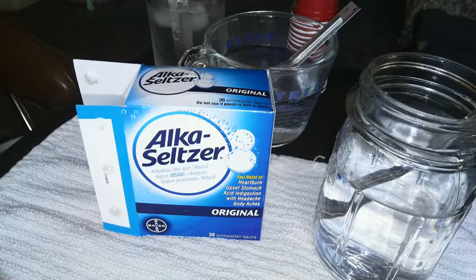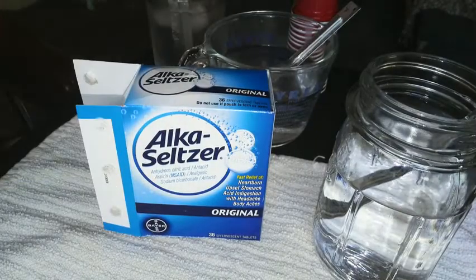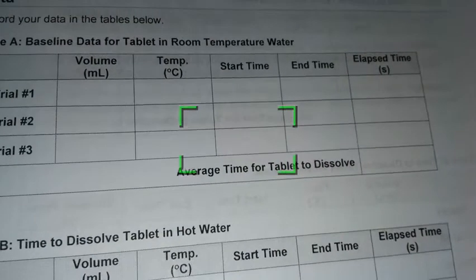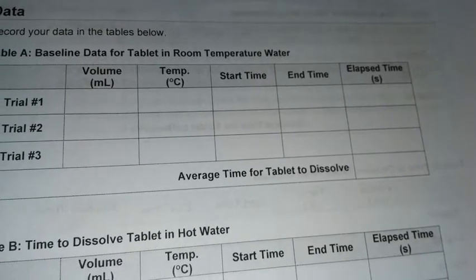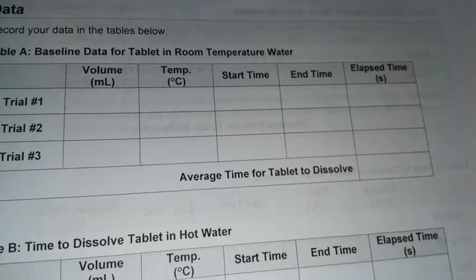Hey everybody, this is Miss Peachy from WCA Physical Science, and in this segment of the video, I'm going to be actually doing the data collection of the portfolio for you. Okay, so you're going to want to have your data tables. I printed out the data tables from that sheet on the website. If you don't have them printed out, that's okay. Just have it open on your computer screen to take your data measurements.